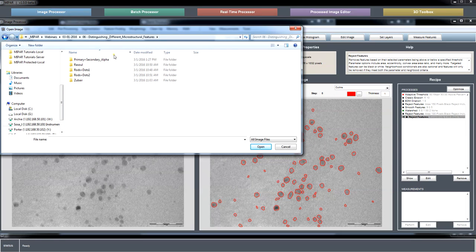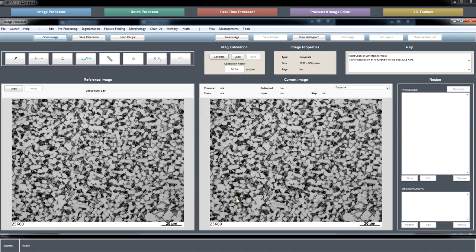Distinguishing different microstructural features was a common topic, so I definitely want to cover that as fully as needed. Here you have your solid white bar on the bottom. Got you. Yes, May, or Kim, absolutely.